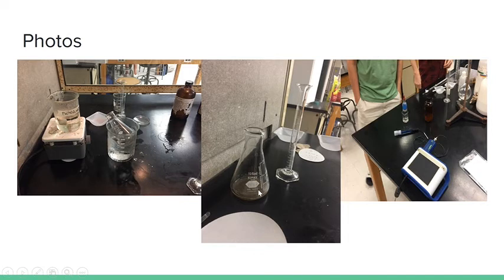In this trial, we had a sort of sludge, a thick, viscous mixture, and it was not easy to filter out. We decided to discard this trial as it was only one of the first trials, but we did learn from our mistakes and decided not to repeat the same mistakes by allowing it to boil over.